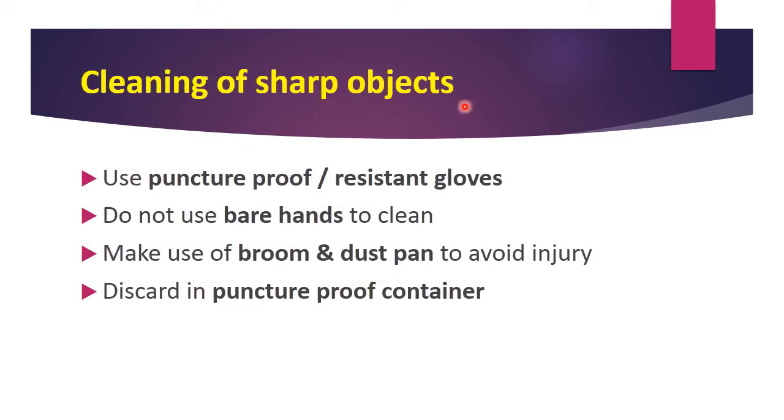Cleaning of sharp objects. How to clean sharp objects? You have to use puncture-proof or puncture-resistant gloves. Do not use bare hands to clean. Make use of a broom and dustpan to avoid injury to your hands, and you have to discard these sharp objects in a puncture-proof container.